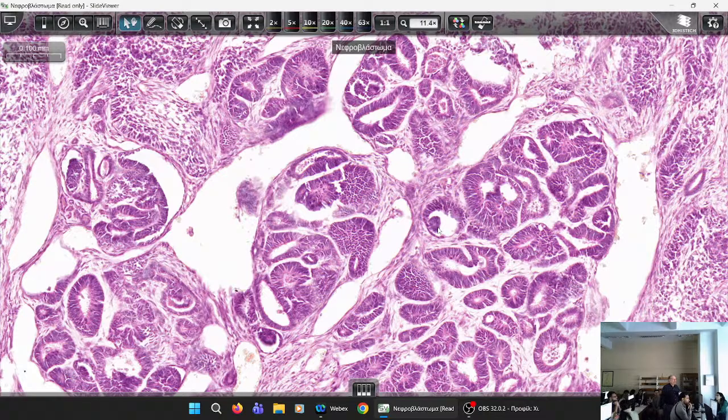Yes, which part of the nephron makes a tuft? Calyces of the body. No, because calyces have urothelial. Yeah, glomeruli, yes. These appear like primitive glomeruli. Not all of them, not all of the structures. I'll show you which. This one. You see the projection? This one. This one. It's how the glomeruli is formed, as you already know from embryology.